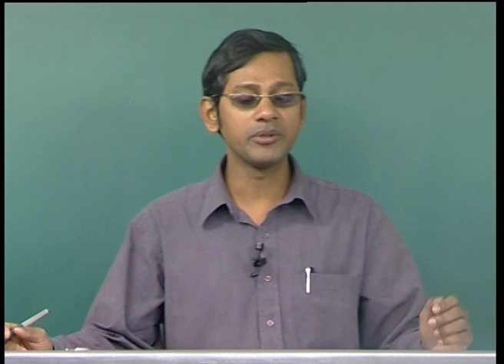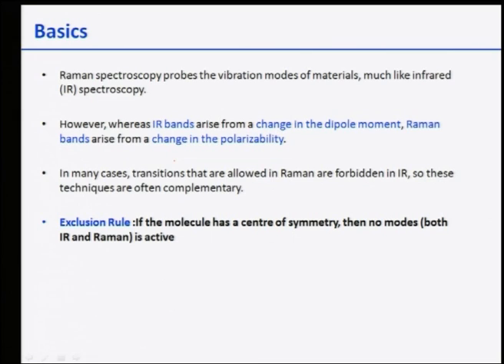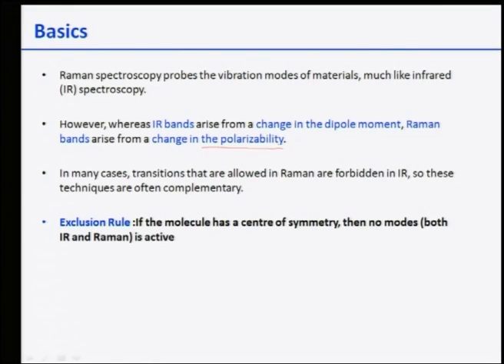As far as the basics are concerned, Raman spectroscopy basically probes the vibration modes of a material. It is more like infrared spectroscopy. I have already discussed infrared spectroscopy a few classes back, and there I showed you by theoretical presentations how IR spectroscopy is related to the vibration modes of the molecules. But there is a distinct difference between IR and Raman spectroscopy. In IR spectroscopy, the bands arise from the change in the dipole moment of the molecule. But Raman bands arise from a change of the polarizability, not the change in the dipole moment, remember. So it is the polarizability change that makes Raman so interesting.